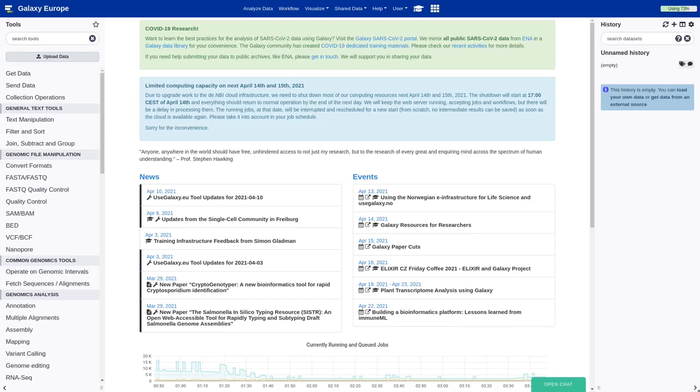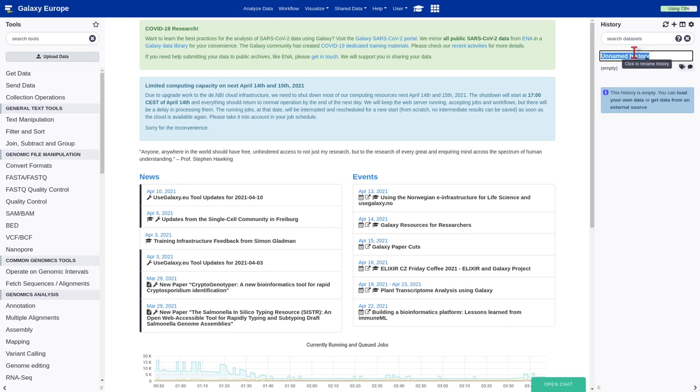Hi everyone, let's start with the practical part of our tutorial. At first, we are going to provide a name to our history, for example, Arabidopsis transcriptant analysis.